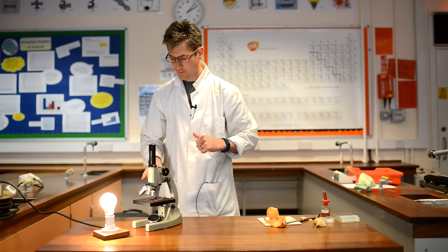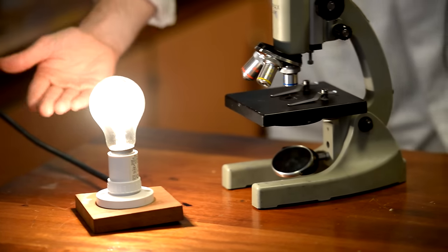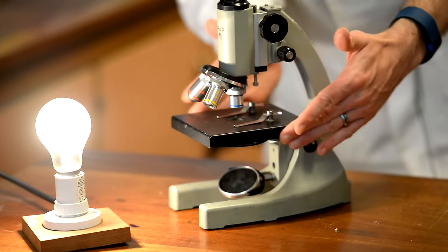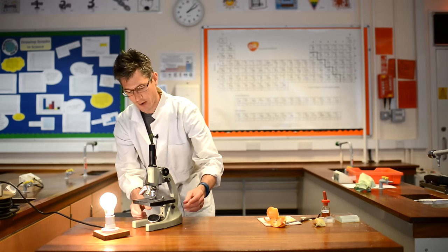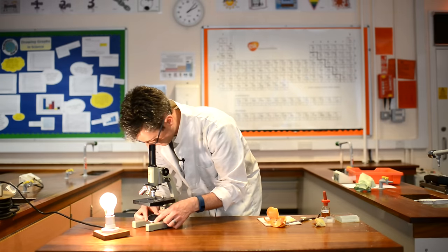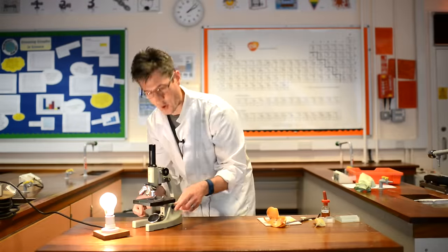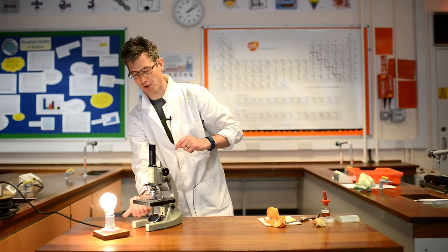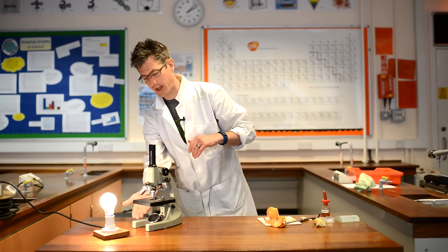Here is our microscope. Notice we've got a light source attached here. The light from this light bulb is coming underneath, and there's a mirror at the bottom of the microscope below what's called the stage. This platform here is called the stage. The light from the light bulb is reflecting up. First thing to do when you've got your microscope set up is adjust the mirror until lots of light comes up — you should see a nice white circle, meaning lots of light is coming up to help you see your specimen clearly.